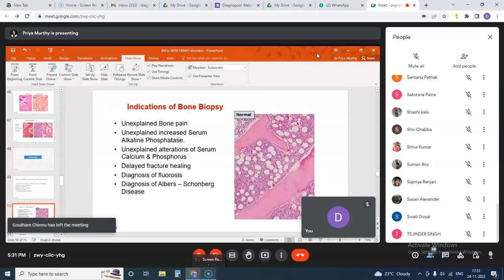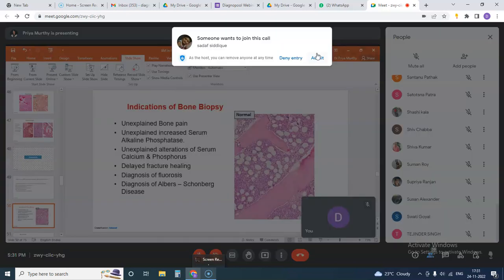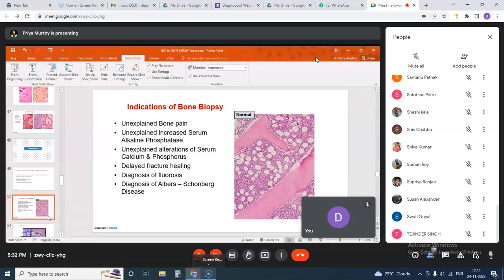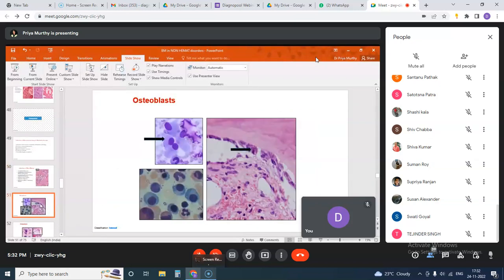So normally when we see a bone marrow biopsy, we see that the bony trabeculae are uniform in thickness. The surface, the endosteal surface, is very smooth, and usually lined by a few osteoblasts, and you may find a few osteoclasts as well. So we know now osteoblasts and osteoclasts are very important in bone remodeling and the general bone structure.